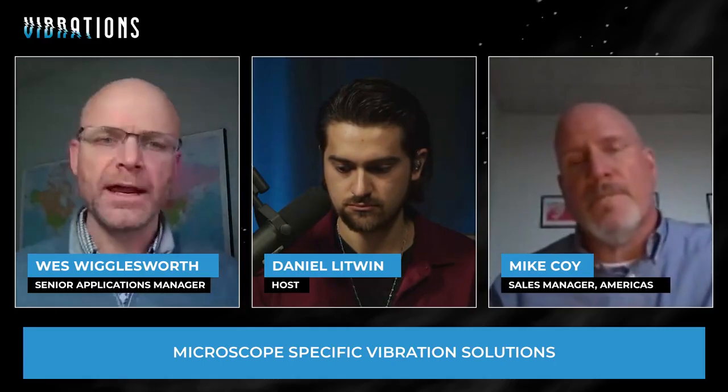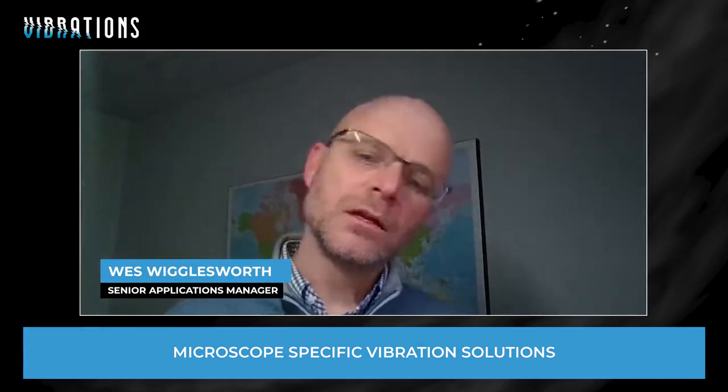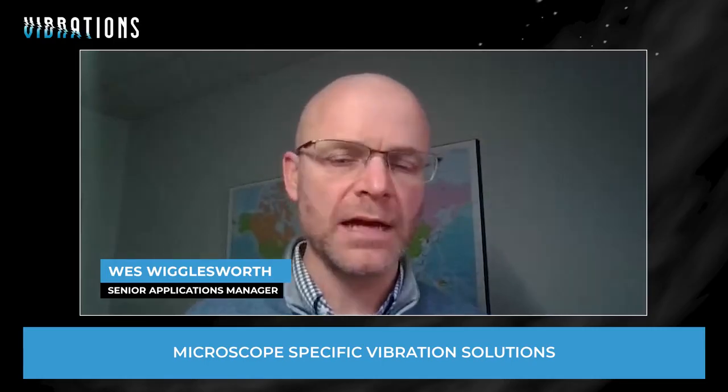So we're very careful, and we need to understand the type of instrument and how it's made so that we know not to support such a microscope with another pneumatic platform or pneumatic isolator. In that case, again, active vibration control that's inherently stiff, we call it a hard mount active system, is utilized. So not only for automated tools, but also for some of the advanced SEMs and certainly TEMs.